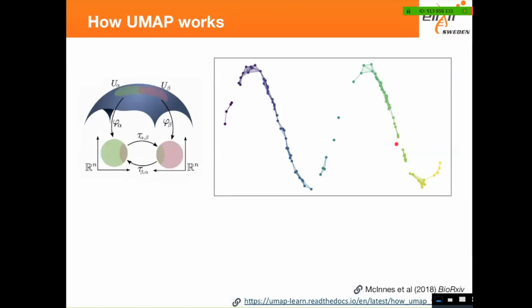And the other trick that UMAP does is that rather than considering the Euclidean distance or the simple distance between points, the method is called UMAP, uniform manifold approximation. Imagine that you have 2 points in here, this one and that one. And actually, they are separated in this real space, let's say like those two here. What it does, it applies a function that converts those 2 points in here, they could be together if you transform that notion of distance in your dimensional space.